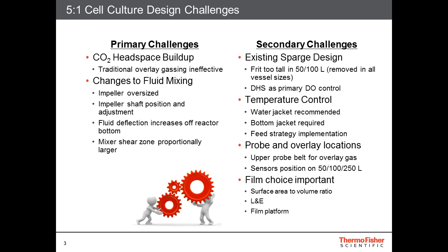On the other side, the spargers. Whether you are using a ring sparger, frit sparger, or drilled hole sparger, it's important to understand the impact of the sparger, and the temperature control aspect. When the volume goes down, it becomes essential that the vessel is bottom jacketed and able to provide effective heat transfer even at the lower volumes.